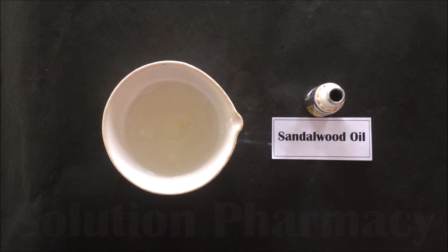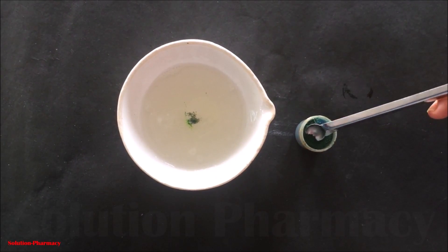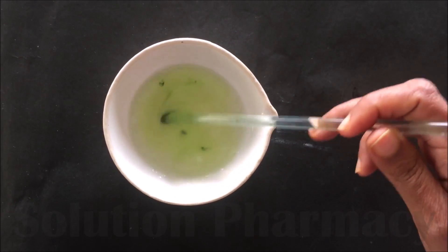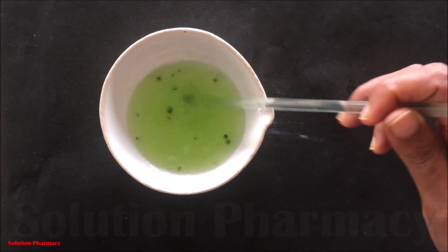Next, add sandalwood oil as a perfuming agent — it is also good for our skin. In place of sandalwood oil you can also use other perfuming agents such as rose oil, etc. After this, if you want to give color to your preparation, add a pinch of food-grade color. Here we have used food-grade green color to color our preparation, then mix it properly with a glass rod.